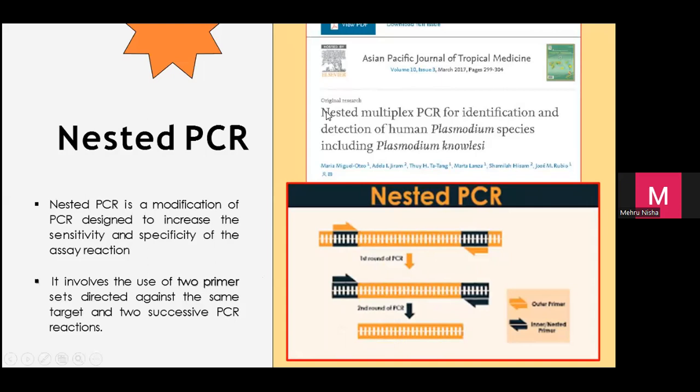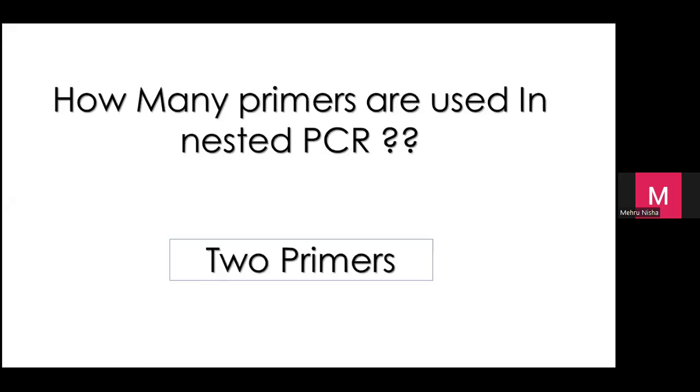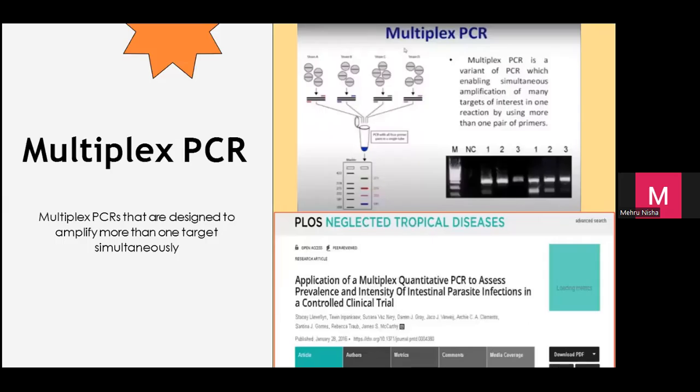So you all understand this? We use 2 primer. So how many primers? 2. Congratulations. Yeah, you understand it. Okay. The next, we call it multiplex PCR. Okay.